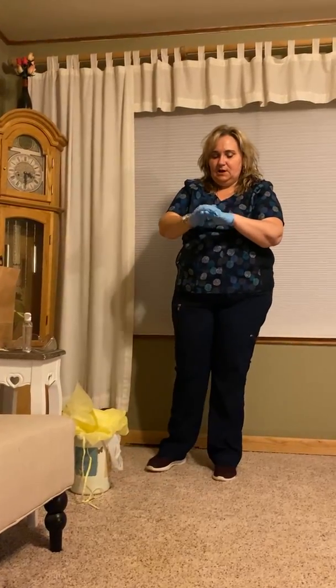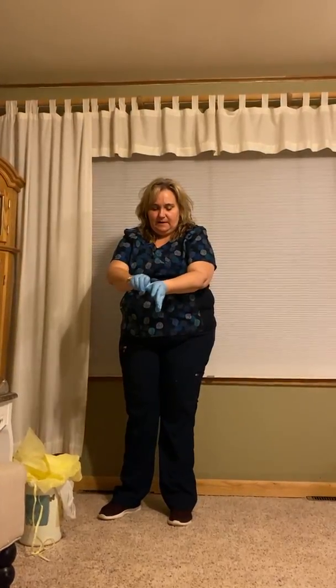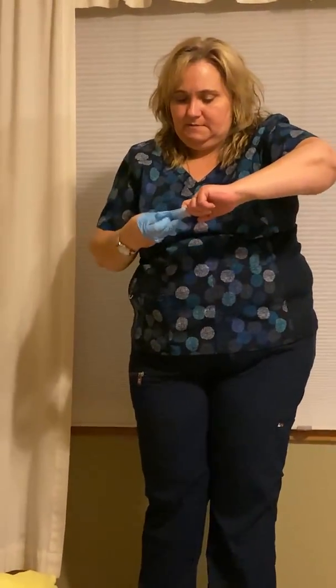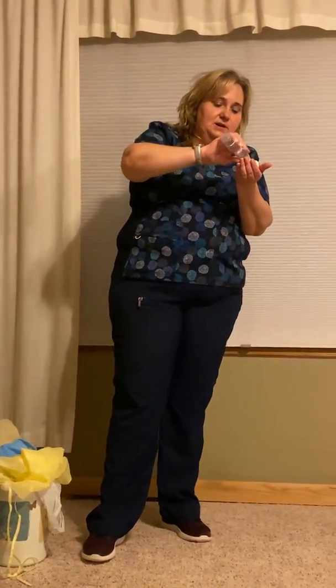Okay, so now it's time to take my gloves off. Grab the corner, hold that, slip my finger underneath, drop them in the trash. Get the hand sanitizer, clean my hands again. I know this might seem monotonous, but it is worth the time to avoid getting yourself sick, your family, and our community.